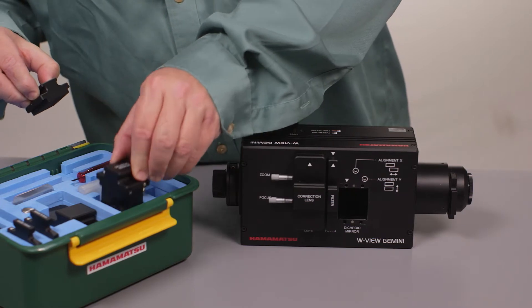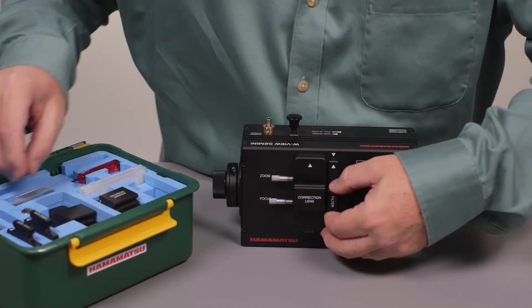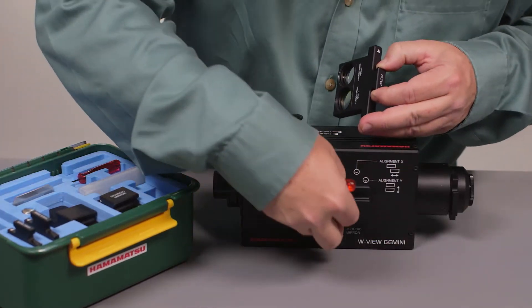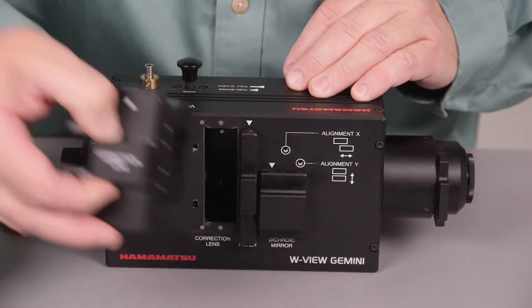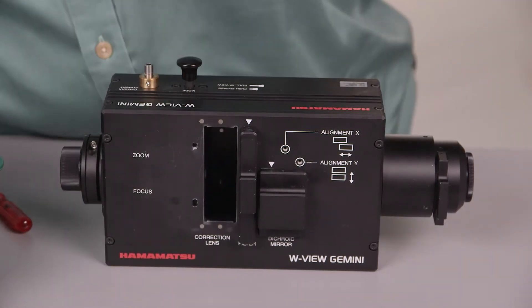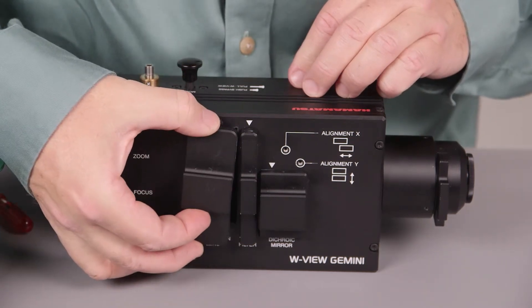There is a place for each one of these pieces to be kept securely. The dust plug goes in where the emission filters were. Next, the Linge Correction Assembly is removed, and its dust plug goes in place.